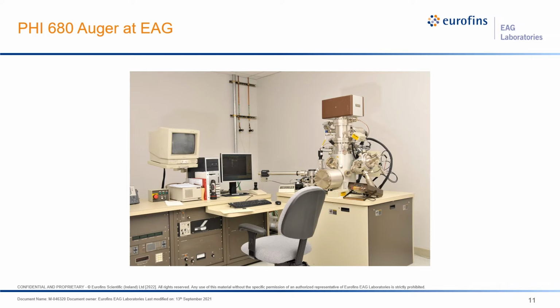These instruments are quite incredible considering you have to have very smooth stage motions and be able to minimize vibration to at least the sub-micron level without using any grease or lubricants for the moving parts that would foul the vacuum. We also need to get electron signals in and out of the vacuum chamber without introducing leaks. And you need to control fairly high voltages within a few tenths of a percent precision.